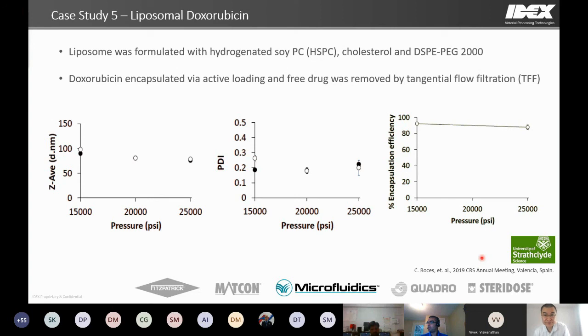Can this be used for techniques other than thin film hydration? This person indicates an example of when salts are used. So that's just kind of the remote loading versus the active loading, maybe. Yeah, if that's the case, the answer will be yes. Like I mentioned, our system essentially performs a downsizing step. It is used to reduce the liposome vesicle size.